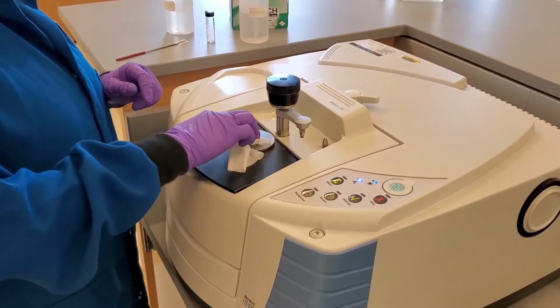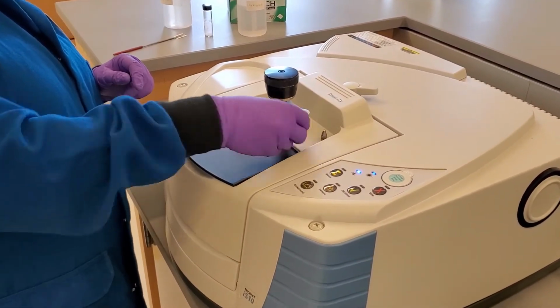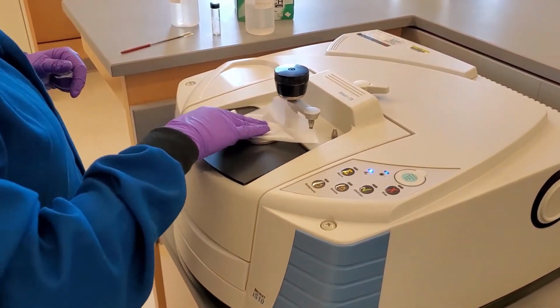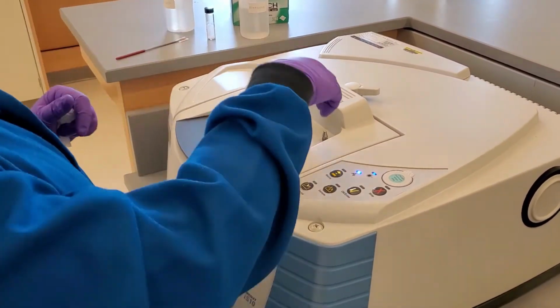Before we take the background of the IR, make sure that the stage and sidearm are clean and dry. Scroll the sidearm down and take the background of the machine.